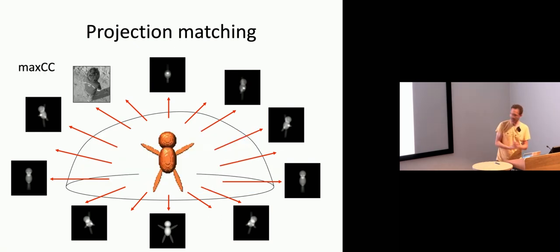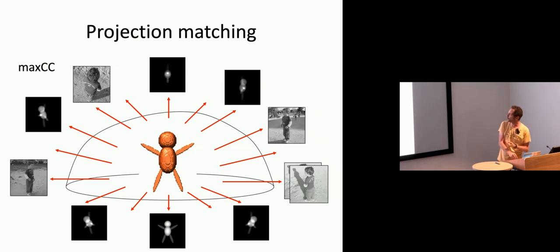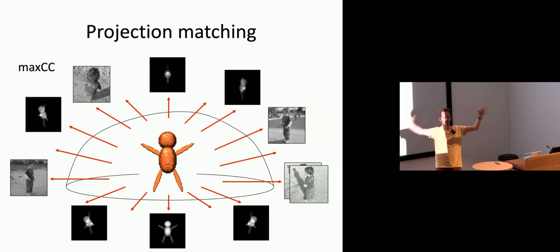And if we do that based on some cross-correlation criterion or so, then we might decide that this top view slightly from the side left is the best orientation for this particular experimental image of Jan. Now, we don't have one of these images. We have many thousands of them. And we can do this process for all these many thousands of images, and each of them will get assigned a relative orientation with respect to the orange puppet.